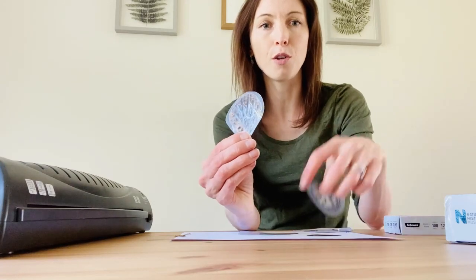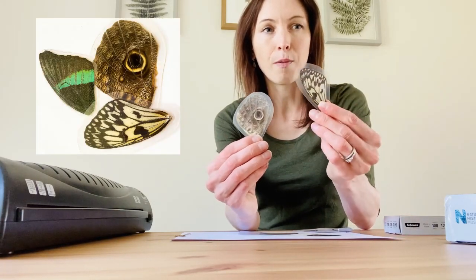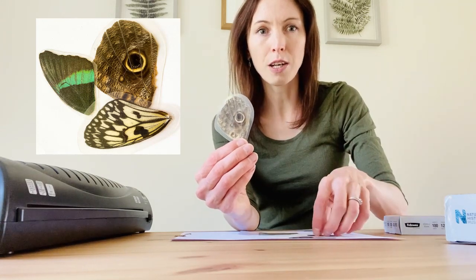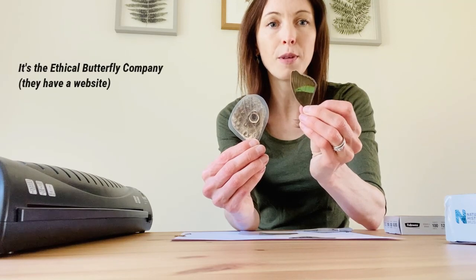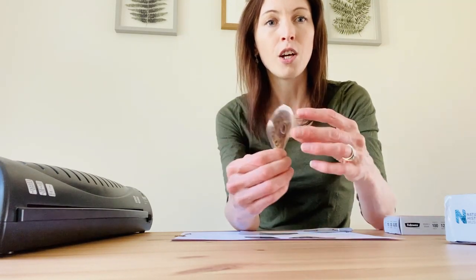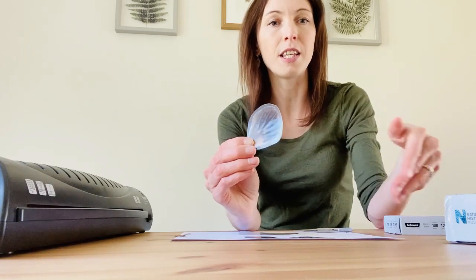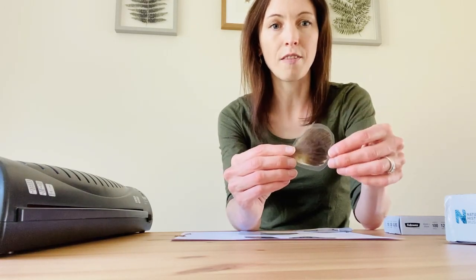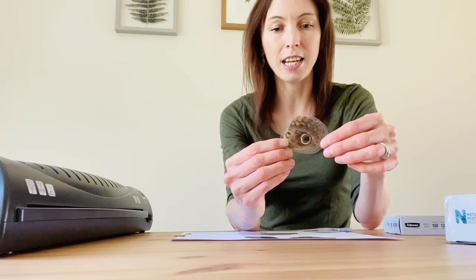I've got some beautiful exotic butterfly wings and these have come from a company called the Ethical Butterfly Group. They're guaranteed 100% natural death butterflies — in fact I think some of them come from tropical butterfly houses around the country. So when the butterflies come to the end of their natural life cycle, their bodies and wings are collected and then sold on, and people buy them to make things like jewellery, or for me to make microscope slides.